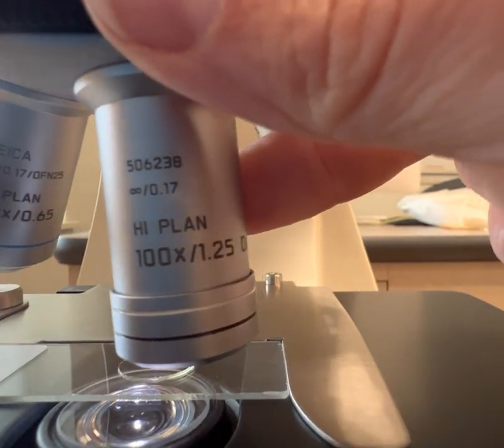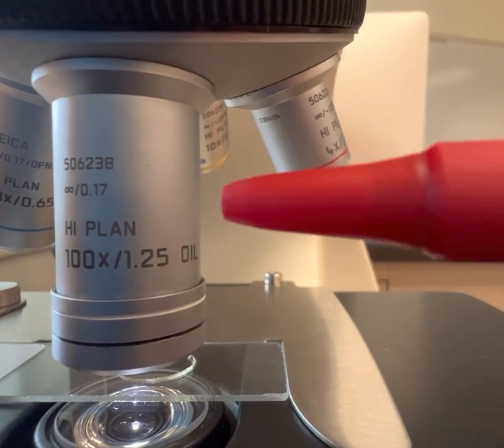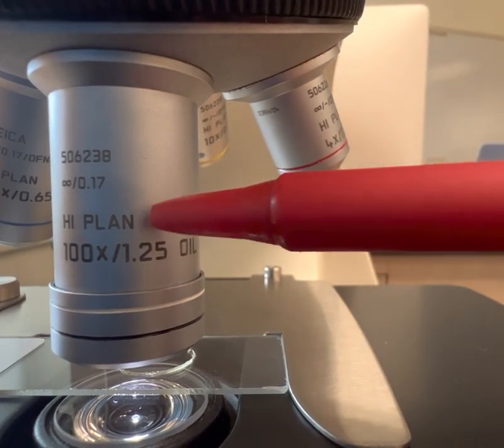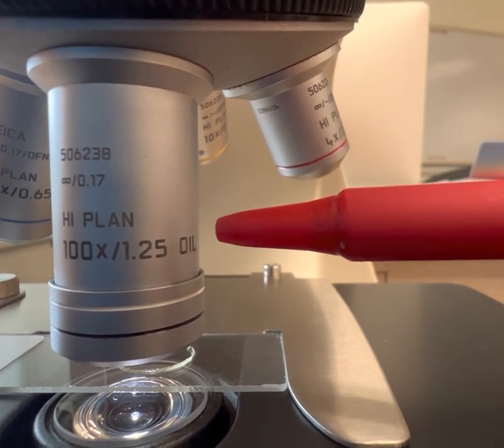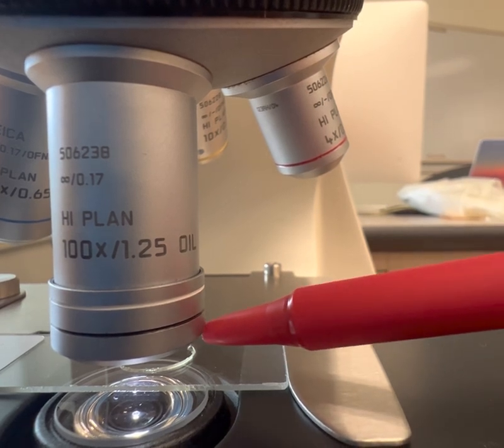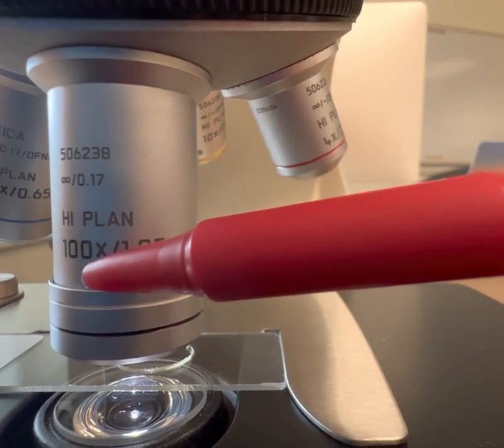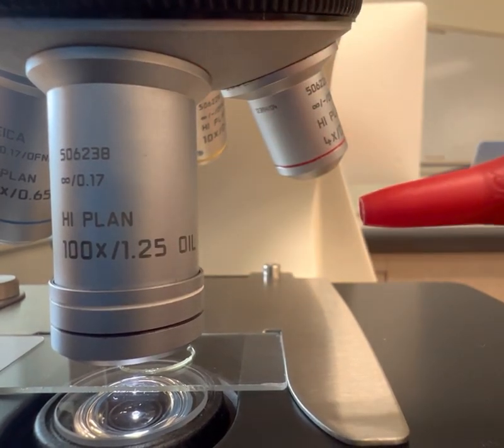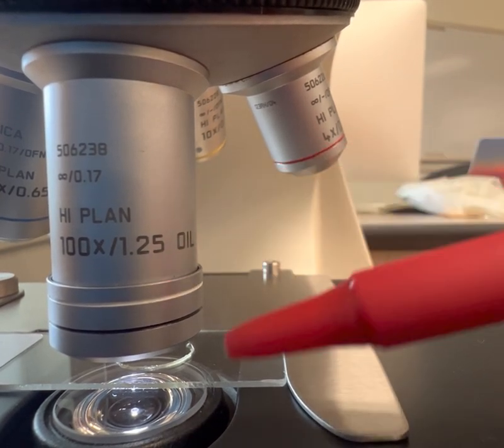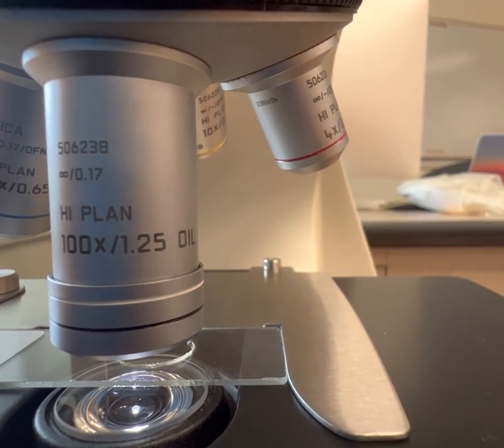And then if we were in medical microbiology, if we were in that class, I would use this lens a lot, but I don't use it every day. If you need to look at something very, very small like bacteria, this is your favorite lens. So this is the oil immersion objective. And so what you would do, you would put a drop of oil on your slide, and that would connect this objective to your slide. And it allows you to get 100 times the 10 in the oculars, and you have 1,000 times total magnification when you use this objective and look at your slide that way. So that's the highest and best you can get on a light microscope.